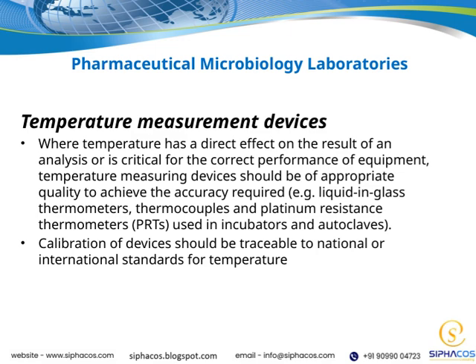These devices must be of appropriate quality to meet the accuracy requirements of your specific process. Remember, calibration is just as important. It should be traceable to recognized national or international standards. This traceability guarantees that your measurements are consistent and reliable, which is fundamental in our field. Overall, maintaining properly calibrated, high-quality temperature measurement devices ensures the integrity of your results and supports compliance with regulatory standards. It's a key part of good laboratory practice and critical for producing trustworthy microbiological data.